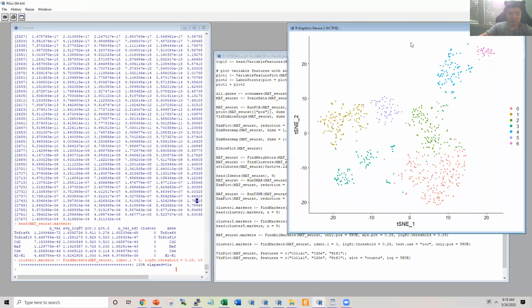But for specific data, if you are interested in specific mechanisms, for example the cell cycle or identifying various cell types: if you are interested in the cell cycle, you should use the cell cycle genes to conduct the cluster analysis, and if you are interested in cell types, you would like to use the known cell type markers to conduct the analysis.